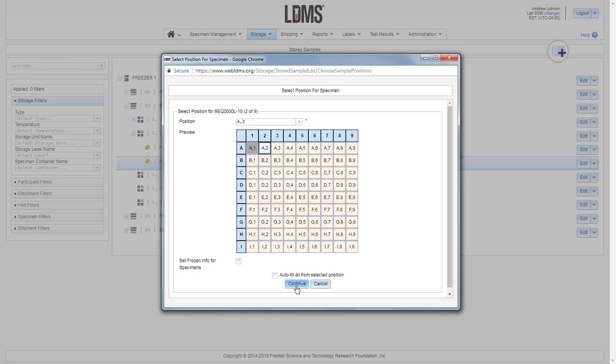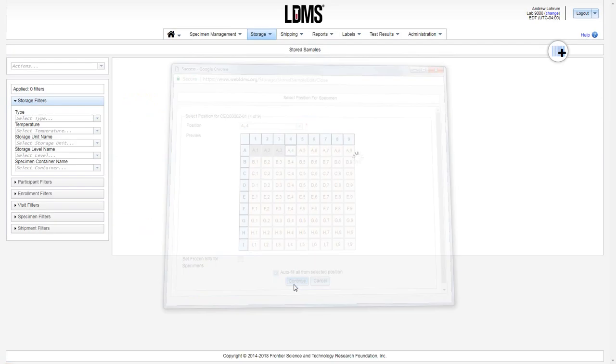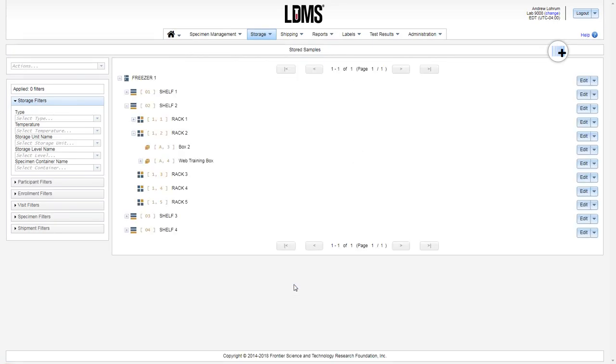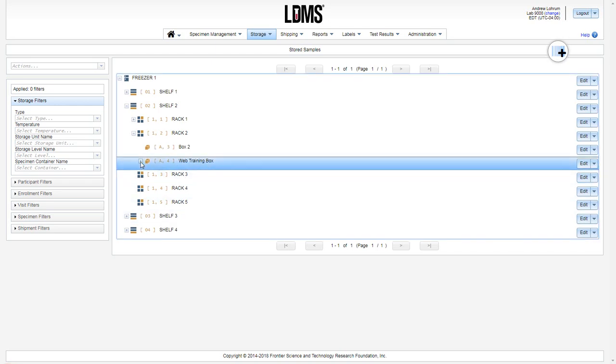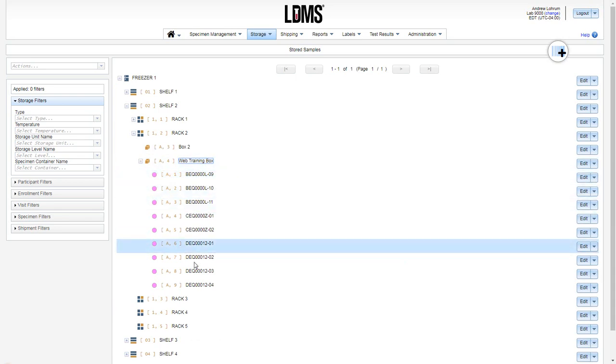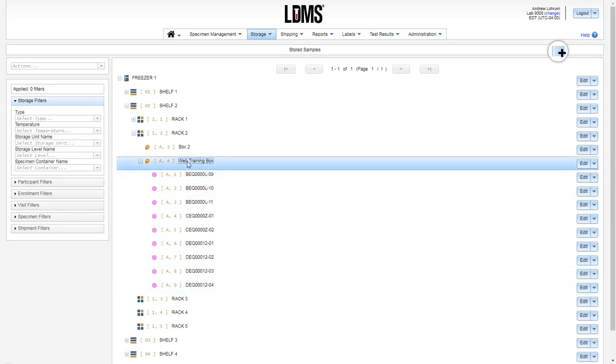You can accept it by clicking continue or override it by choosing a different position. Let us choose auto fill and it will continue to assign the positions for the remainder of the queue. So here in our box by expand we now see the specimens contained inside.